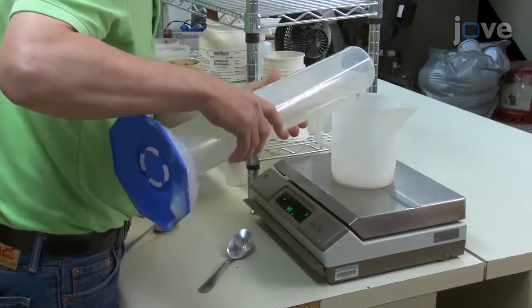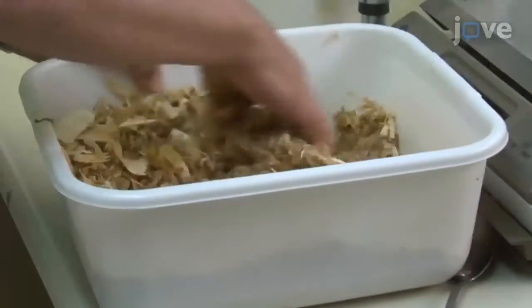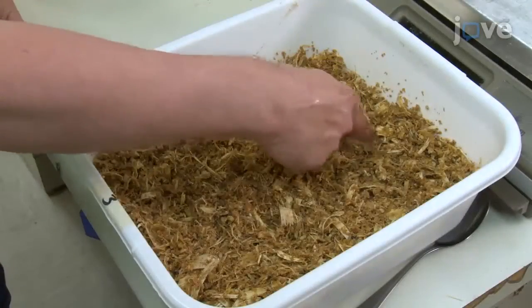To rear larvae from the eggs, make up fresh fly medium in a 10-liter plastic dishpan. Then make a shallow furrow in the medium along the length of the dishpan for the eggs.